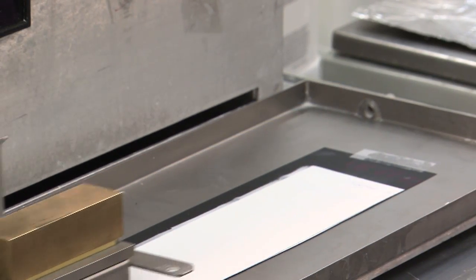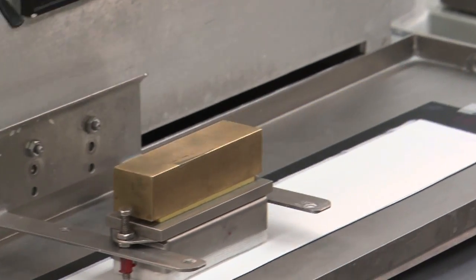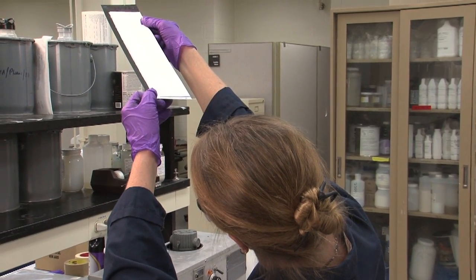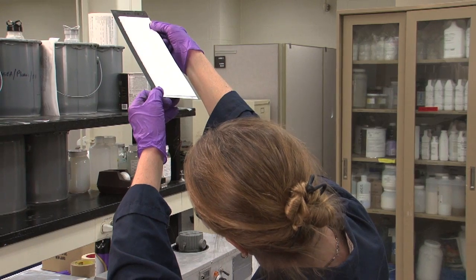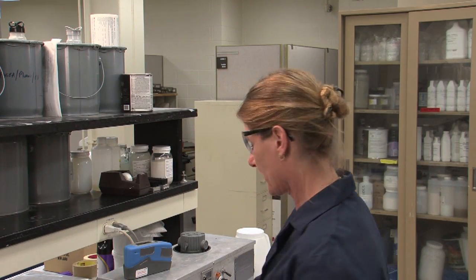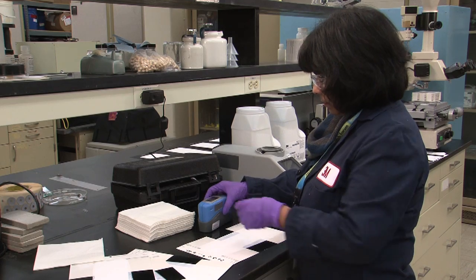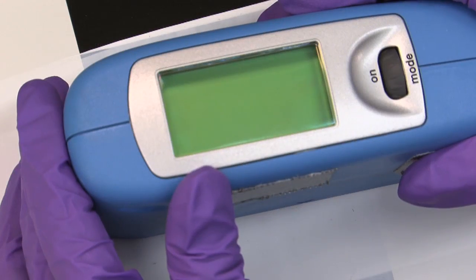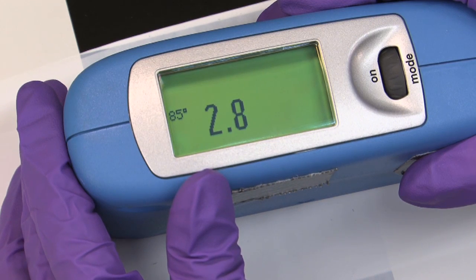To the naked eye, a burnished surface will appear more or less glossy depending on the angle of the light source and the position of the observer. When we test for burnish resistance, however, we use the tri-gloss emitter in order to get an accurate measurement. We remeasure the gloss at the same three points as we did prior to performing the test.